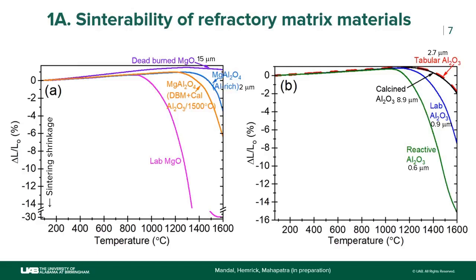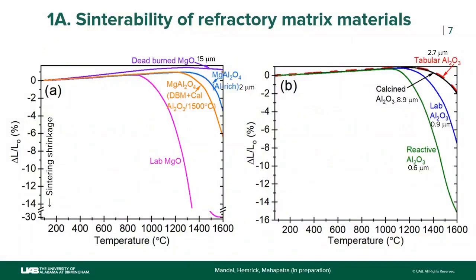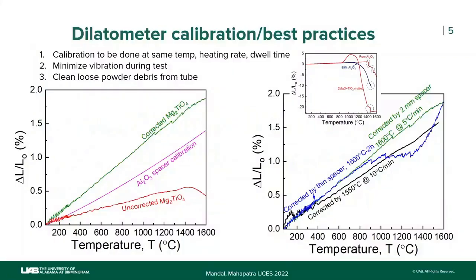I've done 2 millimeter samples and 3 millimeter samples, and as soon as I saw it, I thought, man, this is different. We are not on the same page. So I said, okay, my own internal standard is 3 millimeters, but you can have a different one. Again, a very good point: getting consistent data from this, as I said, the repeatability is about 5%. You get that by doing these small things in the test method itself. That's why ASTM has standard test methods. There is none for dilatometry for this kind of thing, but we might in future.